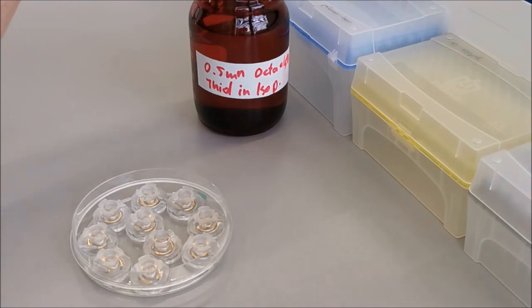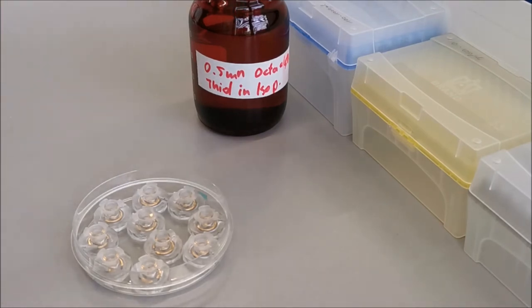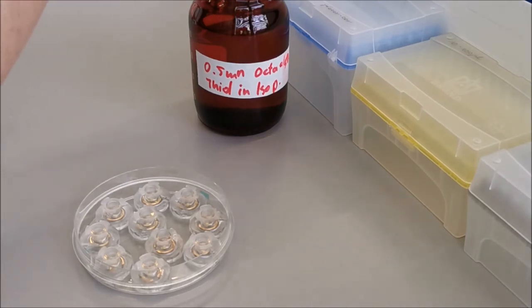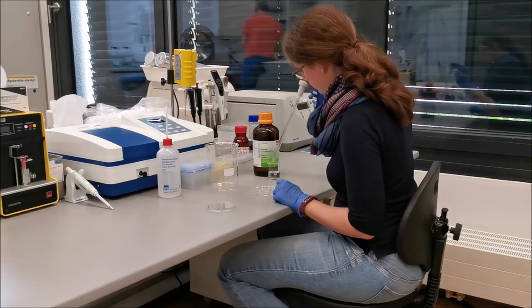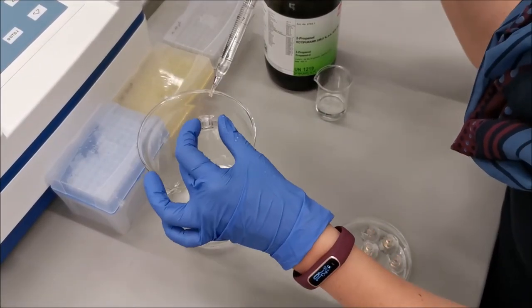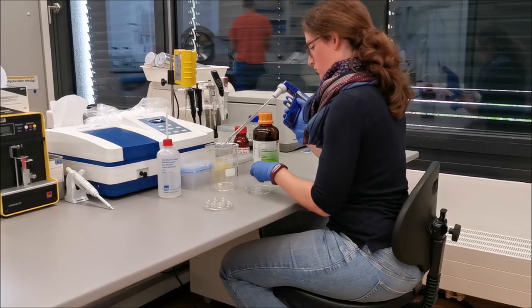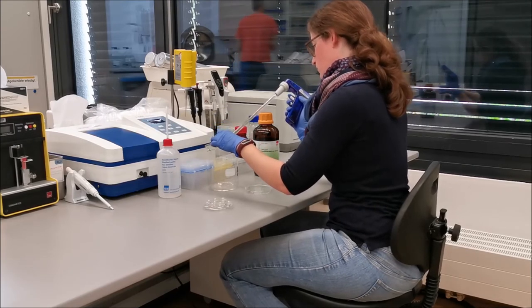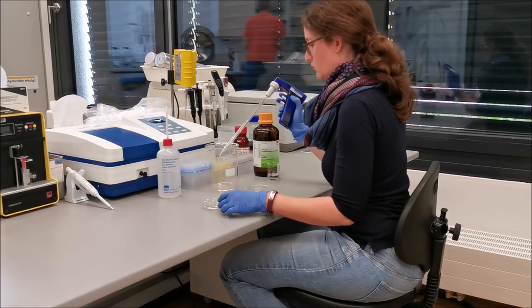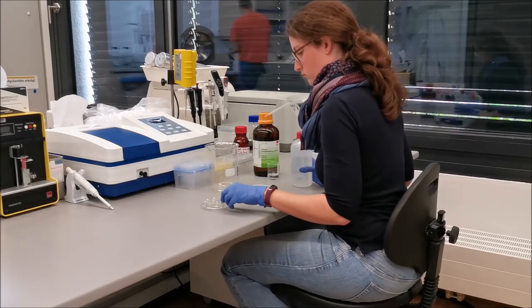The first step in sensor preparation is adding 50 microliter of thiol solution. This assembles the first layer on top of the gold surface. The sensor becomes hydrophobic to be able to absorb the lipid monolayer later on. After 30 minutes incubation, the sensors are rinsed, first with isopropanol to get rid of non-bound thiol. Then we wash off the solvent by rinsing with water.